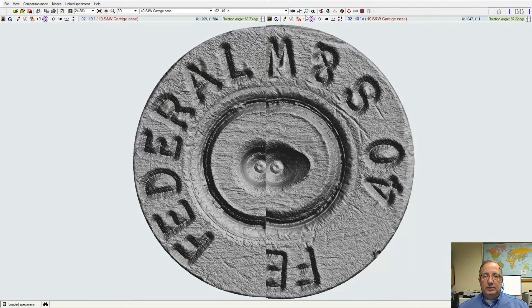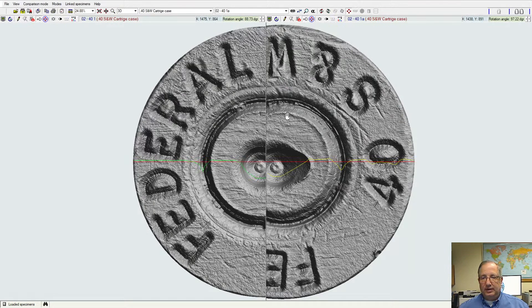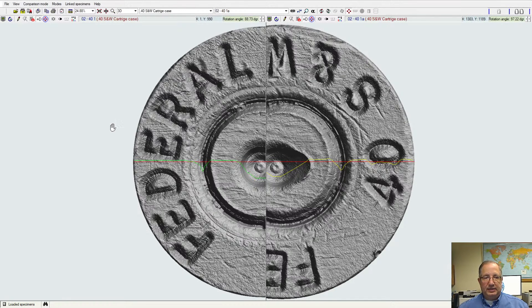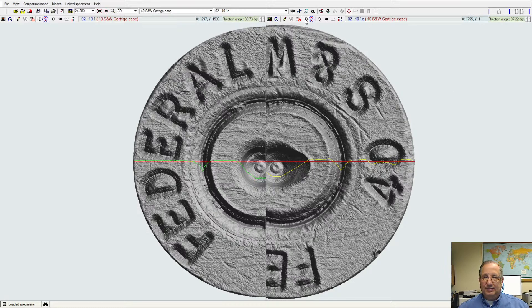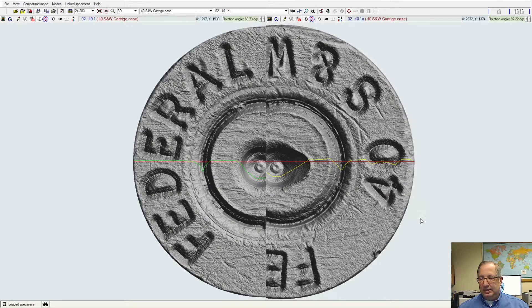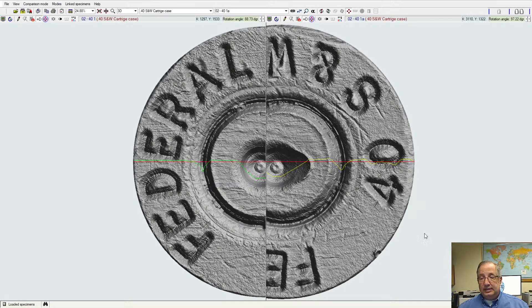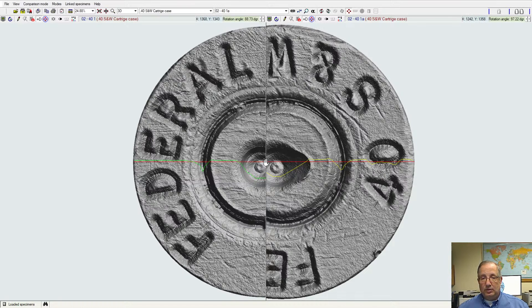One other function that we have here is we can see a cross-sectional profile of the samples that we're working with. So using this plus D function or added dimension, I get a second view of the face of the cartridge case, and you'll see a cutoff that occurs where this one red line is on the sample image.